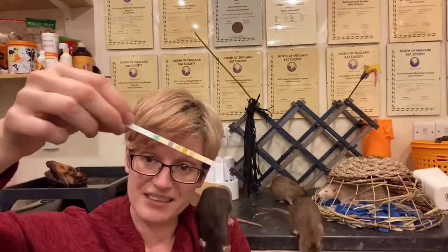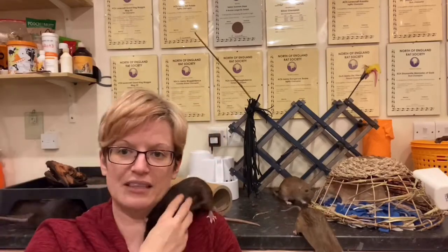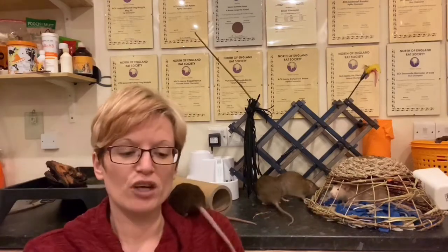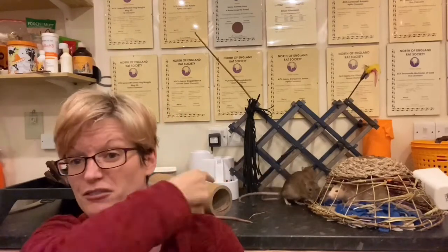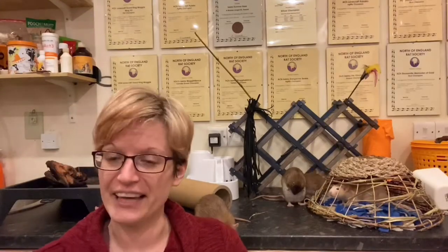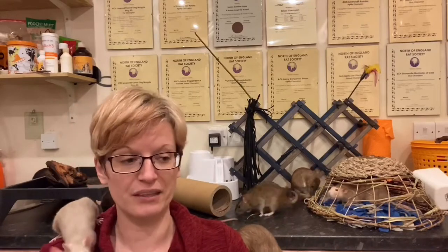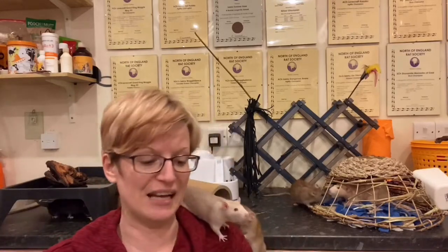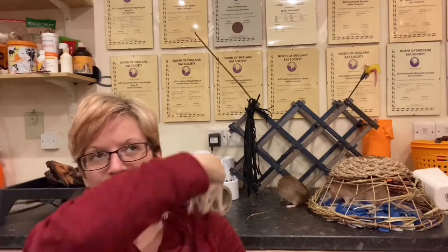In humans you take this little strip and you pee on it. In a rat it's a little bit more challenging because the rat does not have the best understanding of when to pee and when not to pee. Effectively you do a similar thing — what you want to do is get a clean surface, so I quite often use this work surface, give it a good clean down, get the rats up first thing after they've been asleep. Top tip: it does help you get them to pee on demand. Put them on the surface and hopefully they'll give you a nice big puddle, then grab them very quickly before they trample through it, and then take one of these strips and pull it through the puddle.